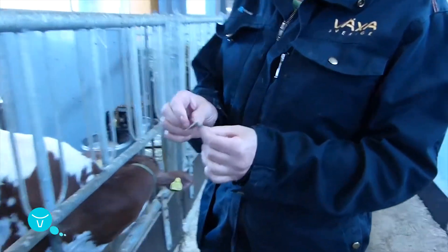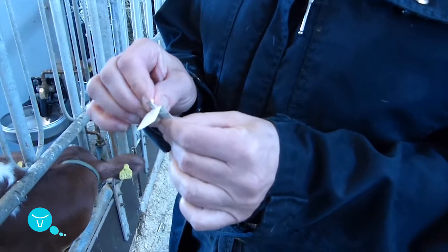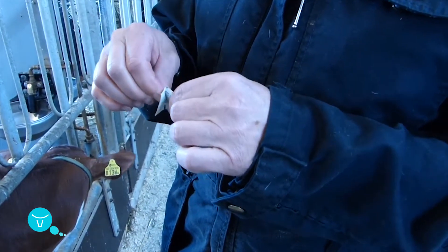When you open the needle, be sure to open it from the opposite end of the tip of the needle. This way the tip remains sterile.